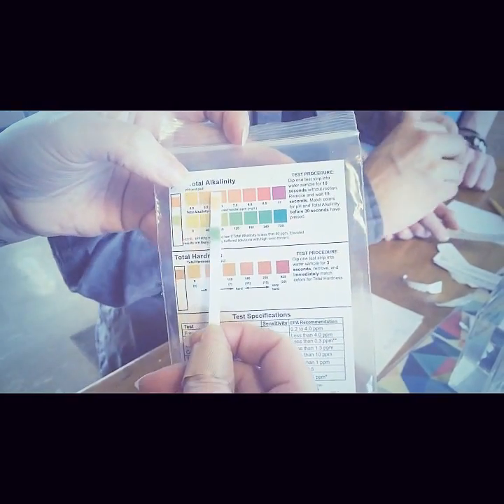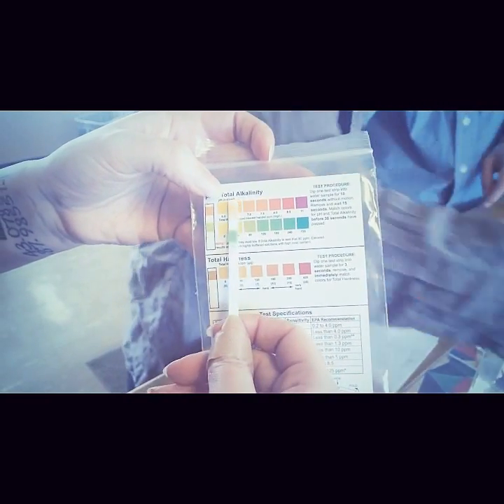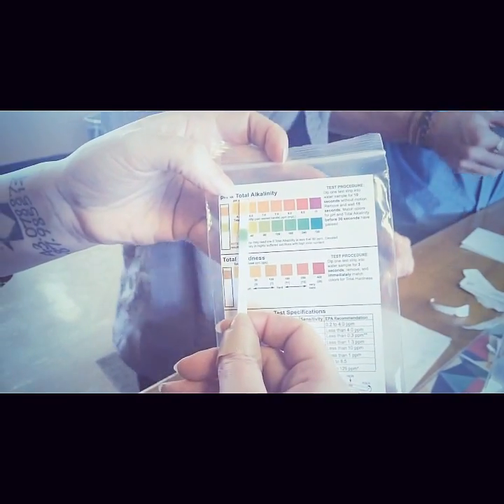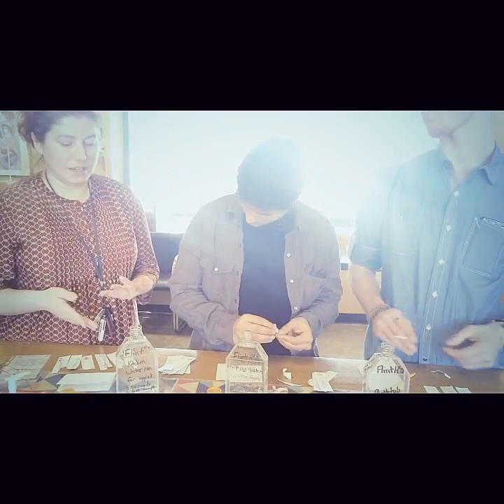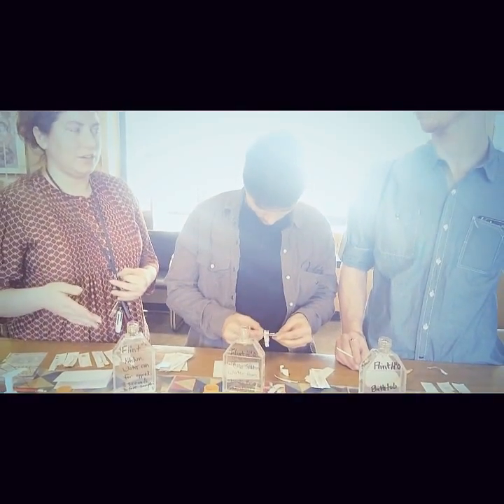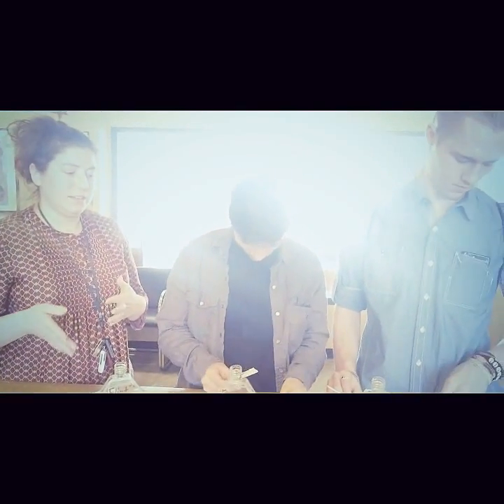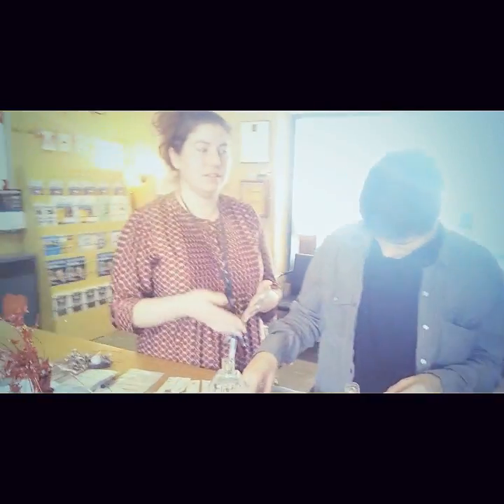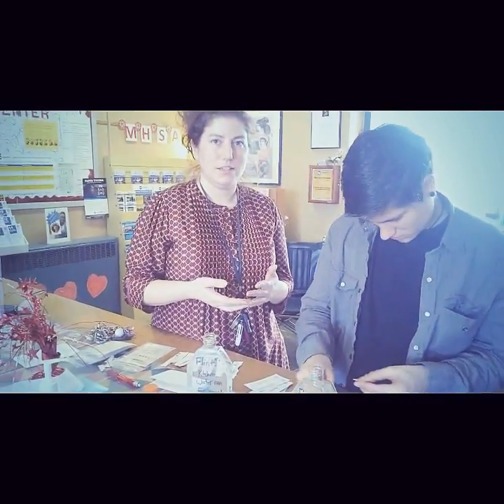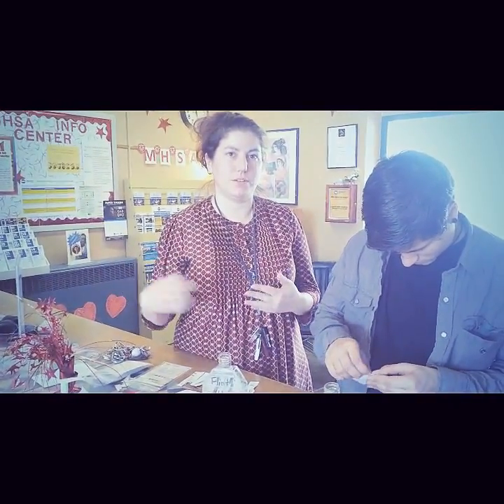And on the top, what we're looking for is that it's at a pH of 7, which this one is not quite at. It's still probably somewhere between 6 and 6.5, which means it's slightly acidic. Okay, so what does that mean for the average folk? So acidic water can help break down the materials that are in the pipes that are leading to the house. Okay. So even if the water coming to the house itself is not contaminated, if it is at an acidic level, it can contaminate the water prior to it coming out of the faucet because it can degrade some of the material that's in the pipe.